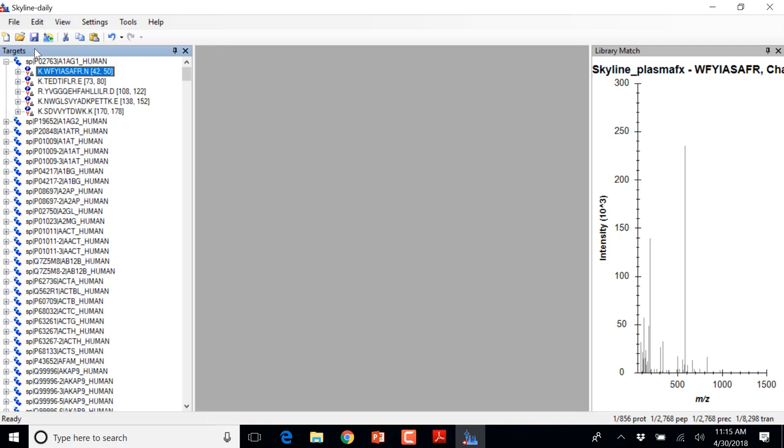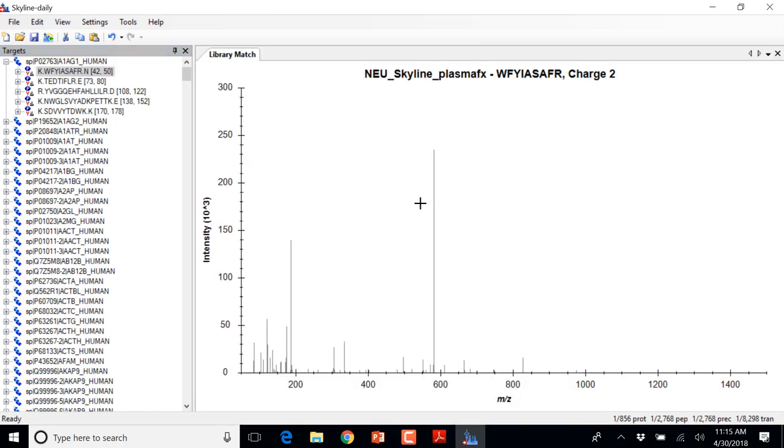Most of them. Okay, so I guess after this current one, I don't generally encourage people to work directly off the flash drive. I usually try to have people copy the data off the flash drive onto your local drive. So we'll go ahead and keep going with this one, but yes, somebody has already run into a problem with the flash drive. So the next thing we do, let's try to get everything off to like your documents directory, some working directory. And the other nice thing about that is that if you mess something up, you still have a copy. That's true.